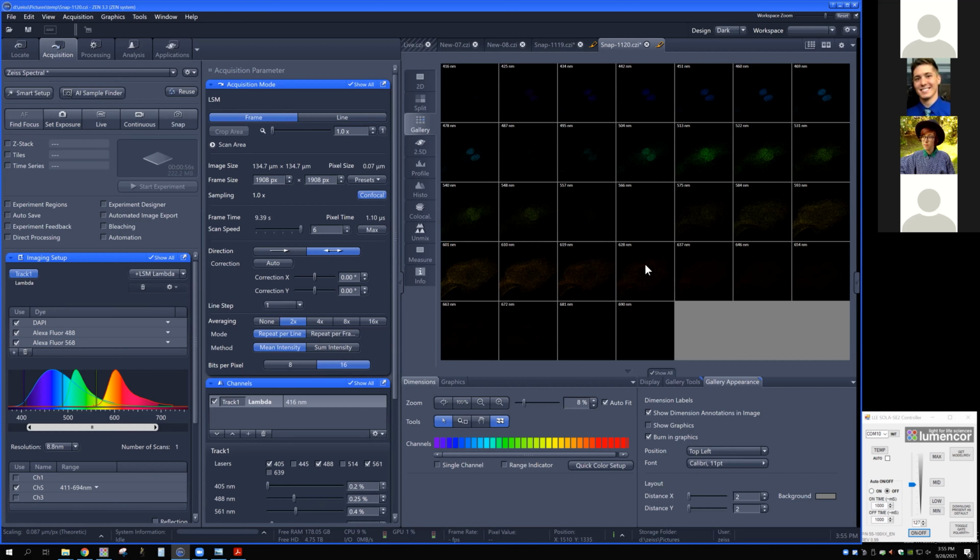And so you can see nicely just the distribution across all of these different fluorophores, right? I hardly have any signal out here past maybe 630 or 640, so really could have trimmed those off and not really lost much in terms of my fingerprint, but let's give it a try and see how it works.